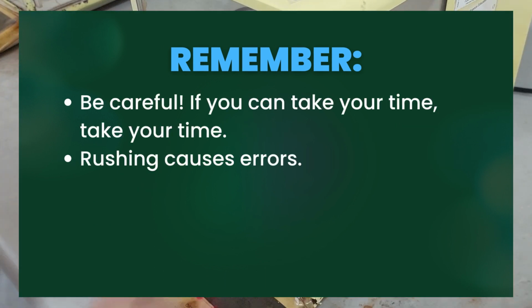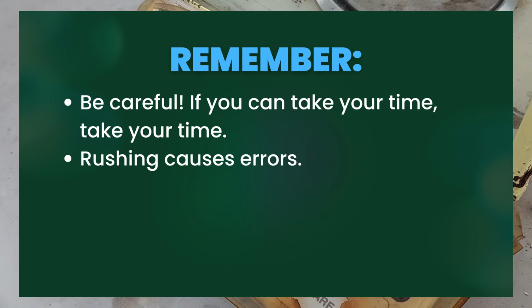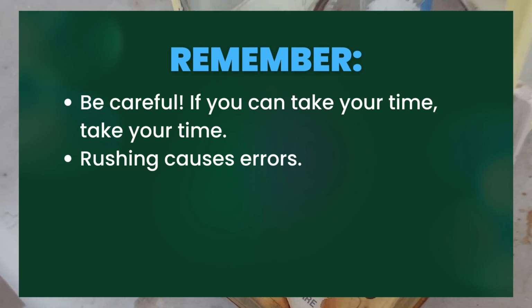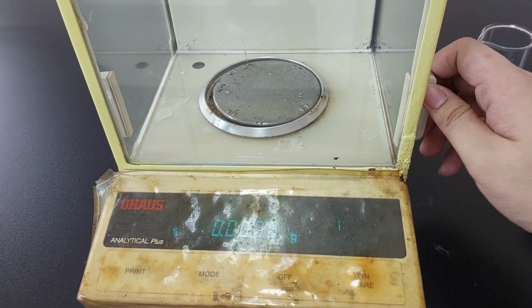Second, take your time when trying to weigh a reagent. Do so by adding small amounts at a time to avoid exceeding what is needed and wasting the excess reagent. And that ends our presentation of the techniques and instruments used in weighing.